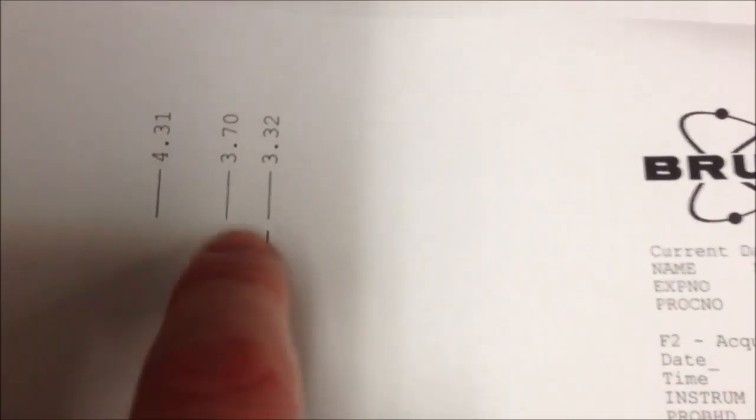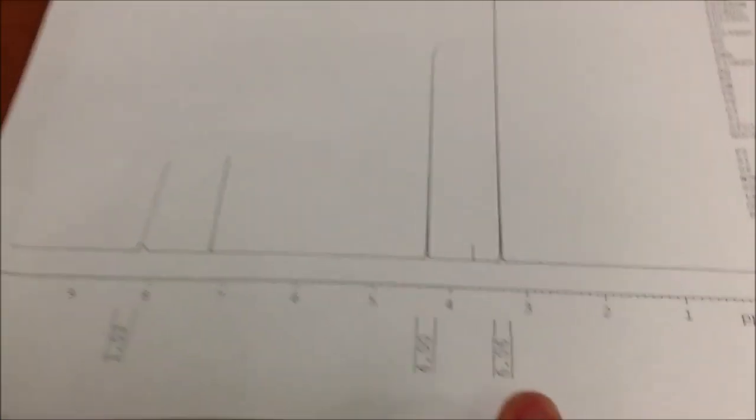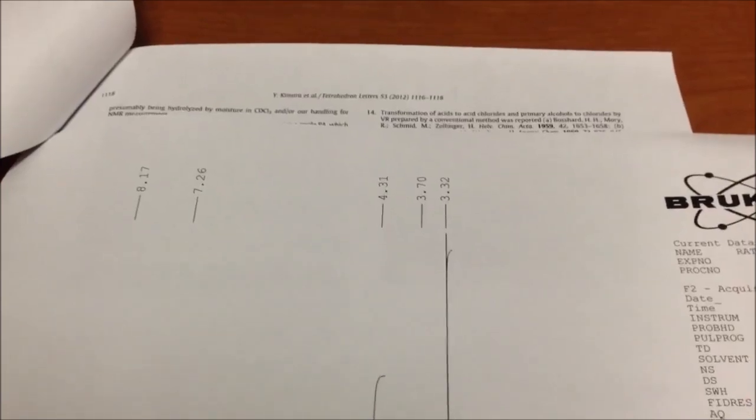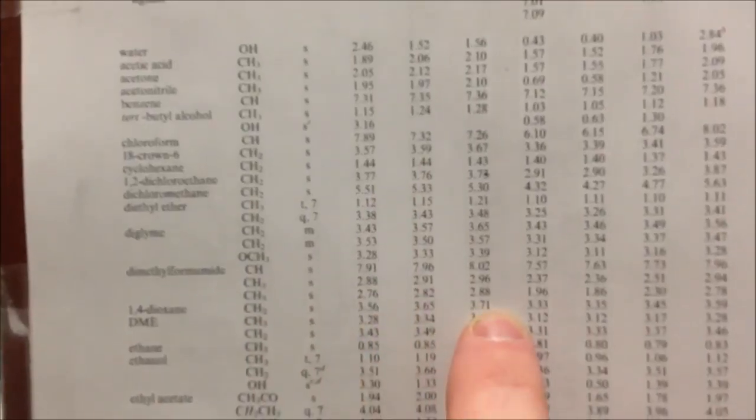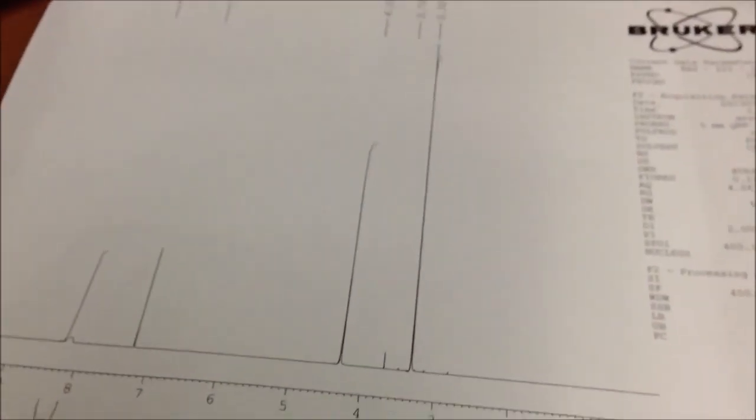And the integrations work out perfectly, 4 to 6. So, we have our product. So, what's all these other peaks? Well, this here, let's see, that comes out at about 3.7. Check here at our solvent charts. And this is a list of chemical shifts for a variety of solvents. And the high boiling solvent that's the hardest to remove was the 1,4-Dioxane. And we can see that the 1,4-Dioxane comes in. So, 3.71 for the deuterated chloroform that we were in. And that's 3.70, so that's the dioxane peak right there. And this is the solvent that we did the sample in, the chloroform peak. And this is some unknown impurity. So, overall, I'd say it looks very good, and we did a great job. We got the product, and it should work for our purposes just fine.